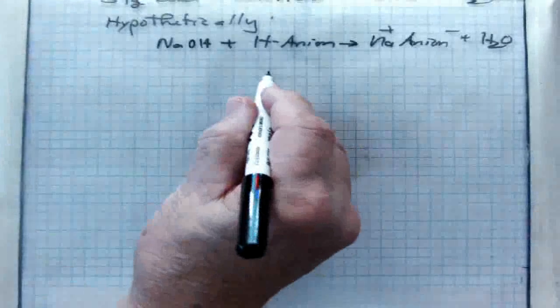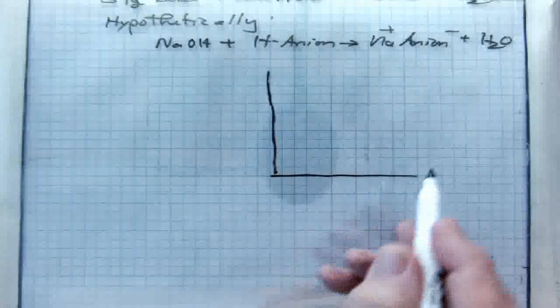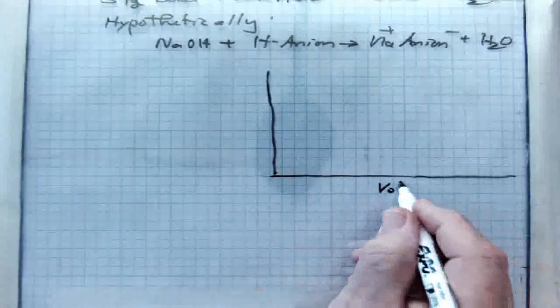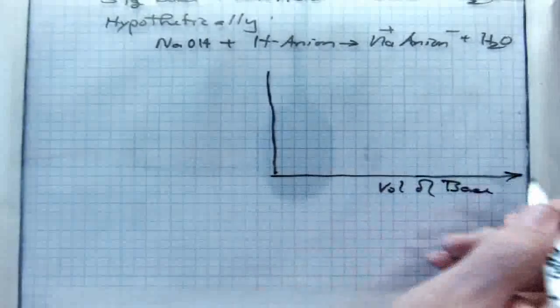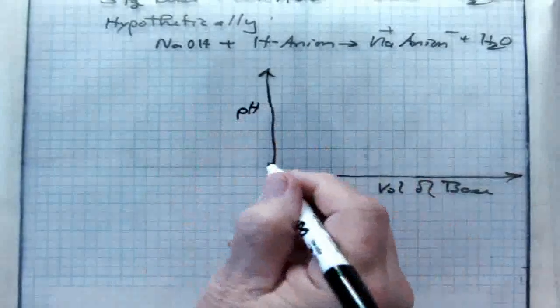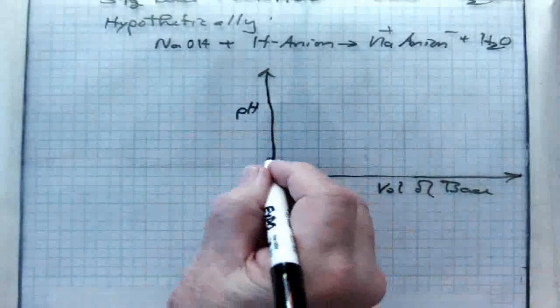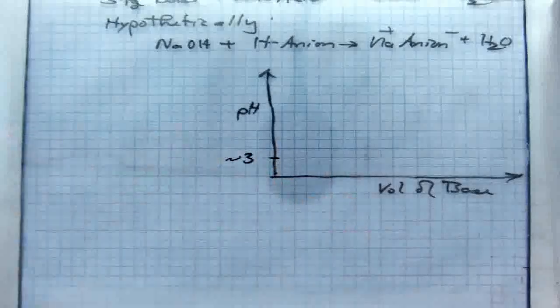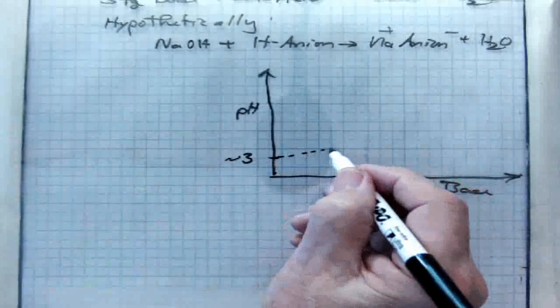This will start at a pH of around 3, not to scale guys, and will proceed to follow the standard looking titration trend, say to very high, maybe 12, and the max is 14 kind of thing. The equivalence point's right here.